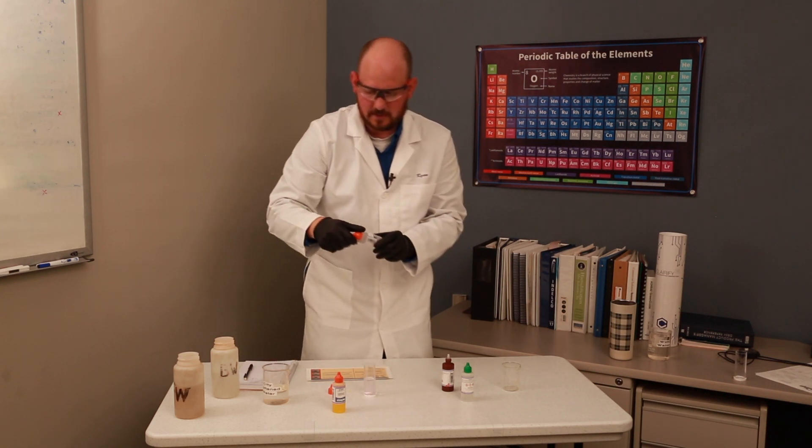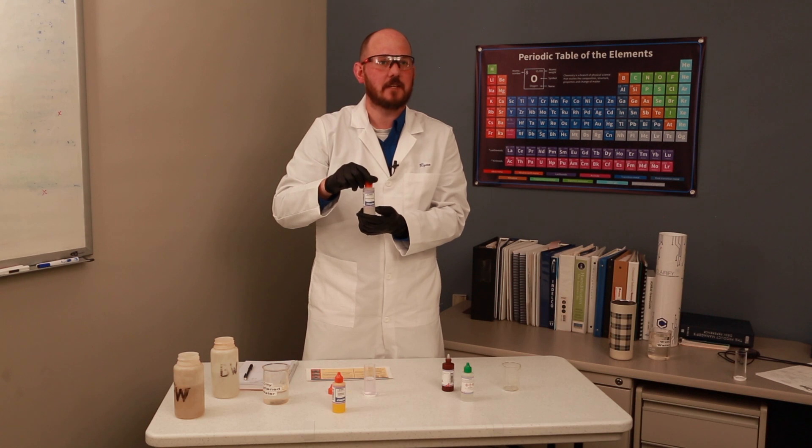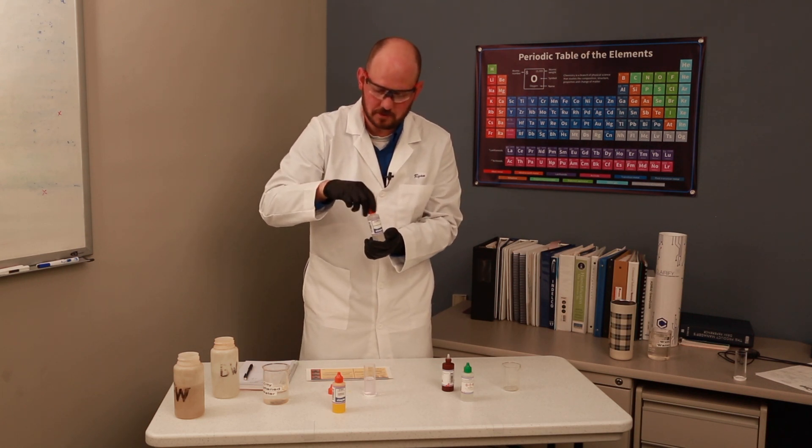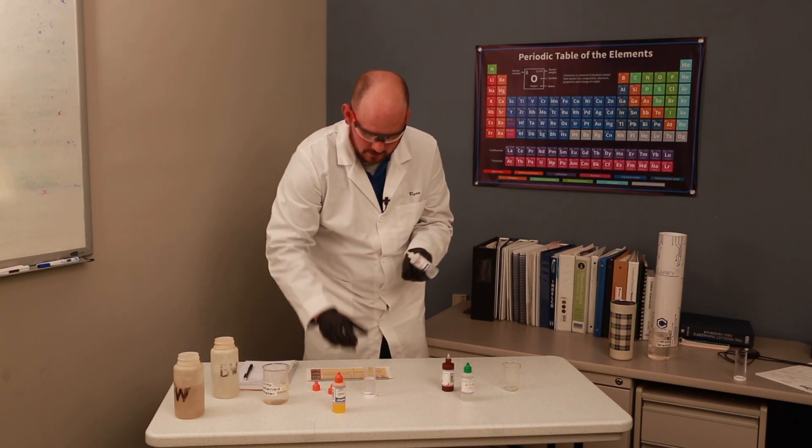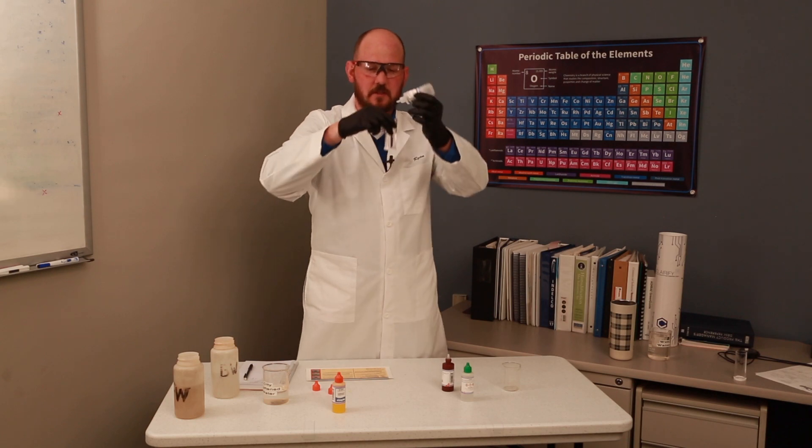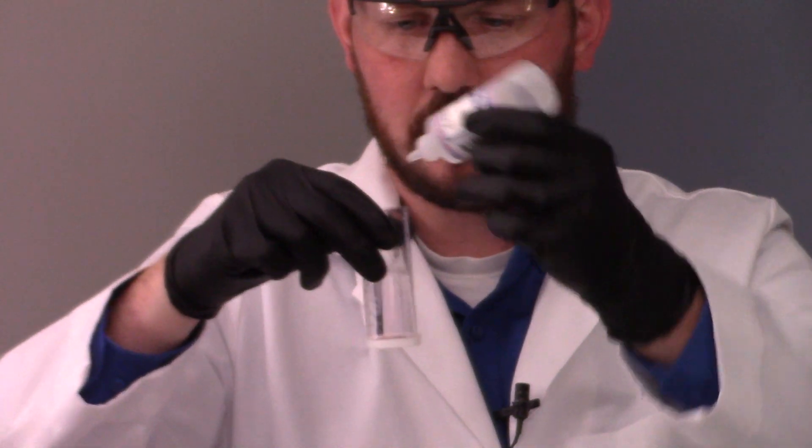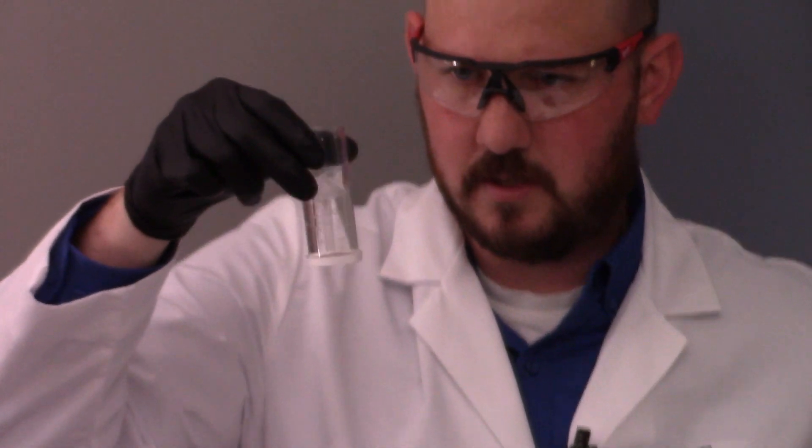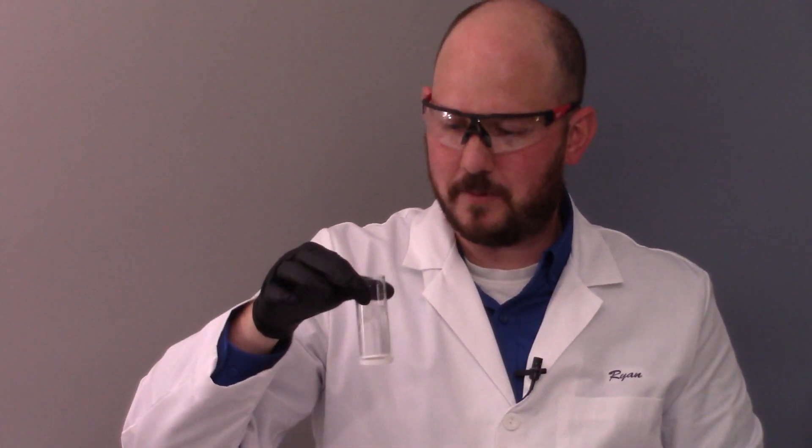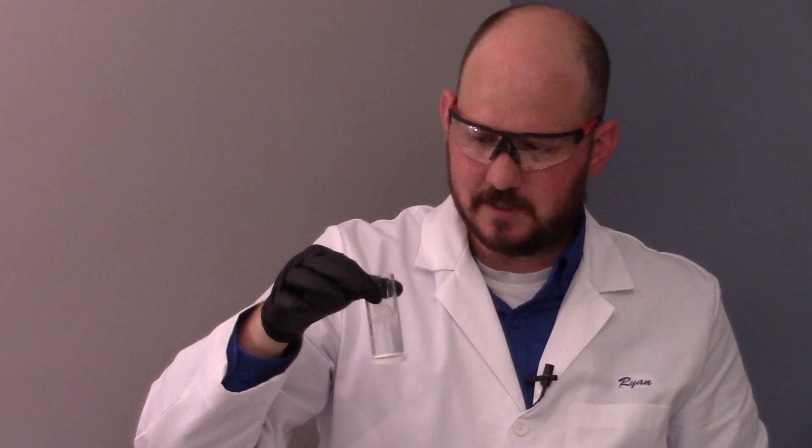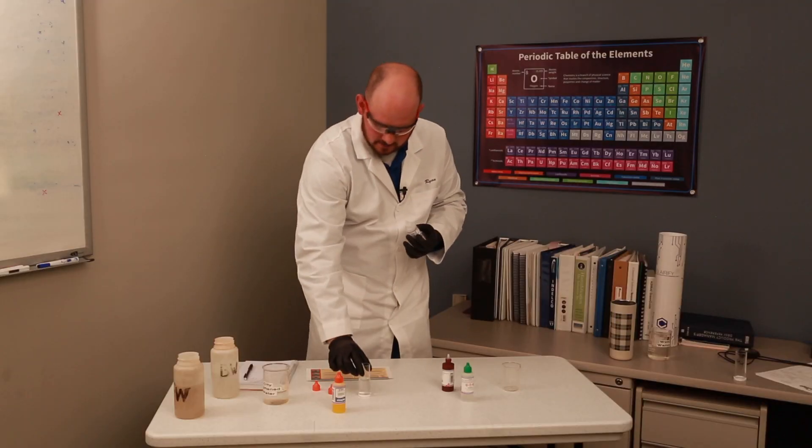So the step for this is you're going to add your sulfuric acid, nicely capped orange, and you're going to add dropwise until this turns clear. That is definitely clear. I hope you can see it on camera. We're just neutralizing the pH for this test, and we will continue.